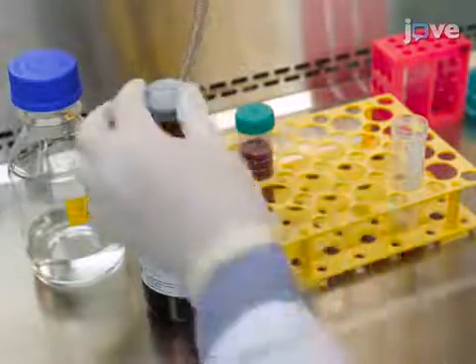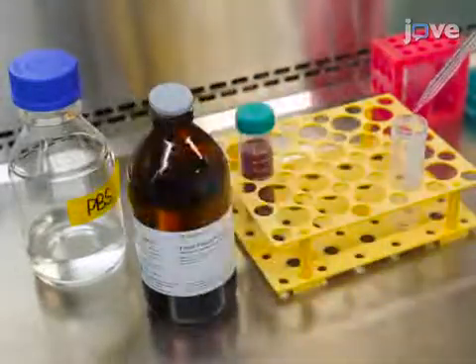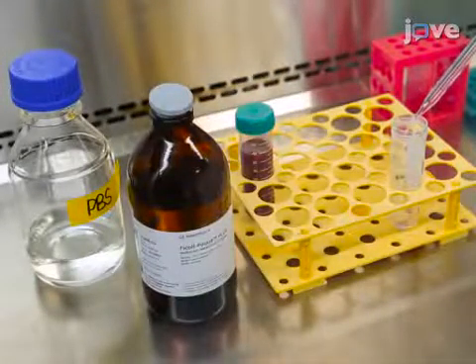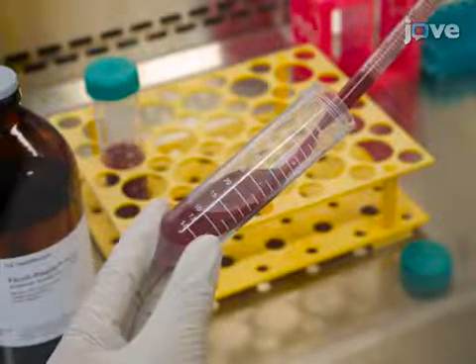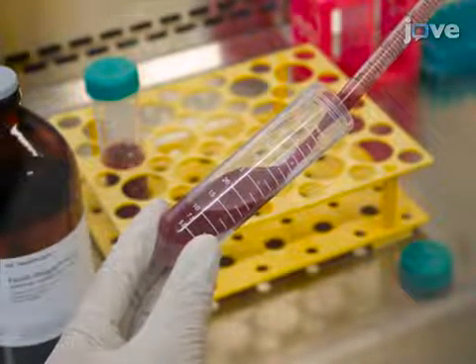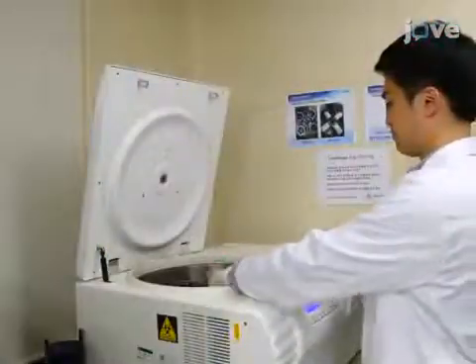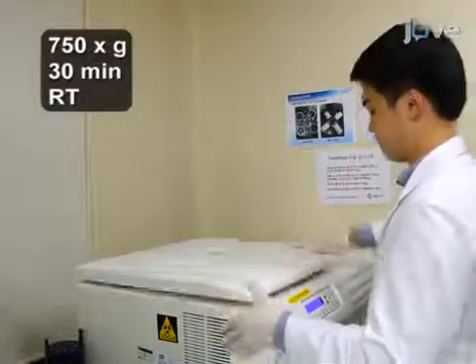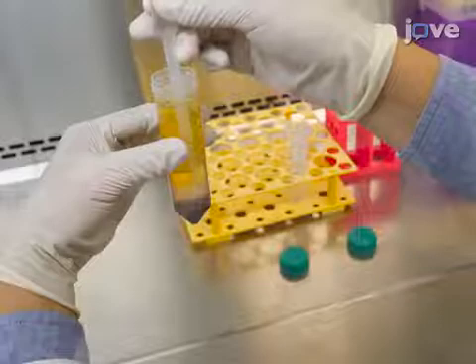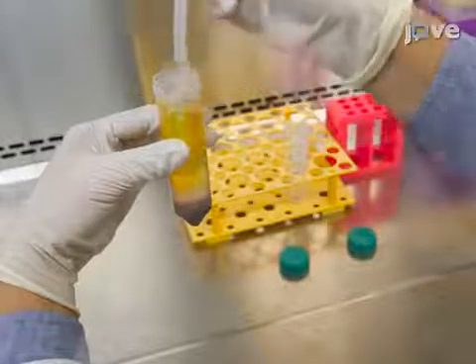Afterward, add 10 mL of density gradient media to a new 50 mL conical tube and carefully layer the diluted blood on top of the density gradient media. Then, centrifuge the sample at 750 times G for 30 minutes at room temperature without a centrifugation break. After 30 minutes, carefully transfer the buffy layer to a new 50 mL conical tube.